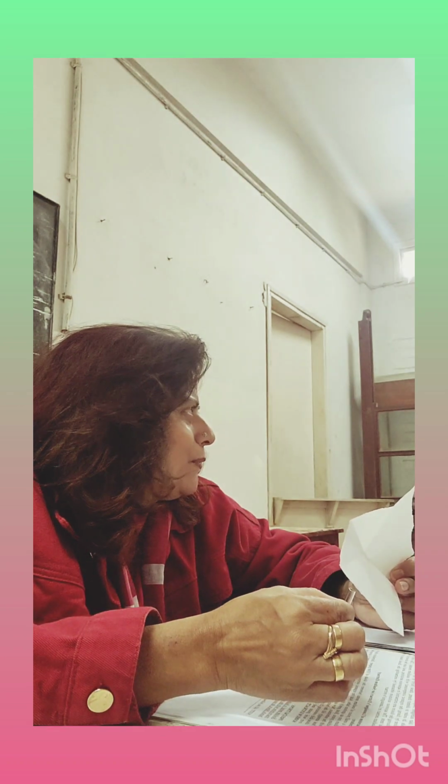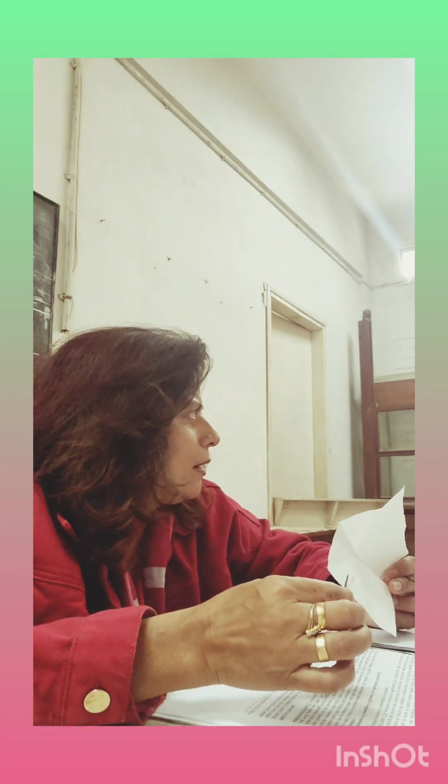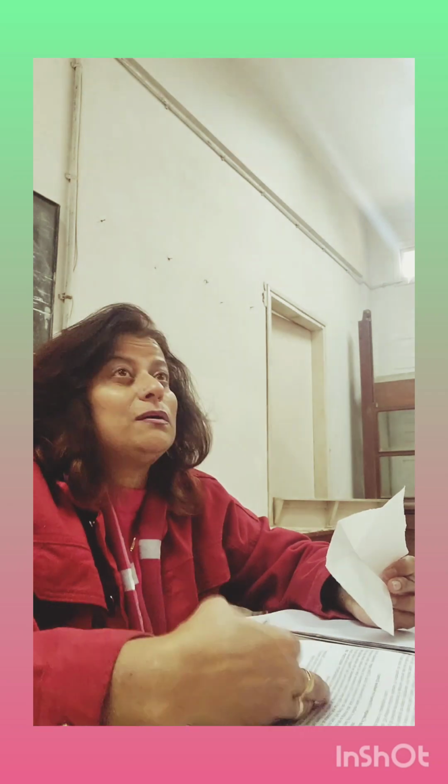Never put water inside it unless your instructor asks you to do it. Your teacher, your lab instructor. I'm your lab instructor right now. I'm giving you instructions about the things, the precautions and everything, and how you are going to proceed with the reaction. I'm explaining each and everything. So this is also part of that: do not wash it. It is ready to use. And after igniting it, going through the process of ignition, it is going to be over. You will read the procedure and then you'll see how it's going to be finished, how it will end up.